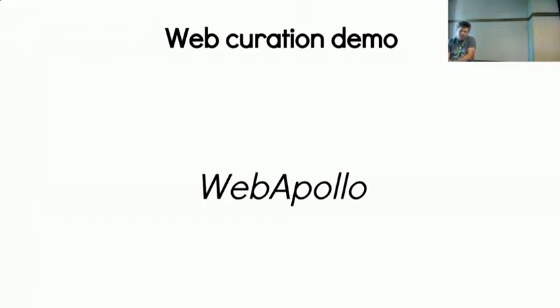Yeah, and I guess the point, like Troster's made over and over, is that if you have data that's not quite clean coming in, you have the ability to go through and manually annotate it to fix it.